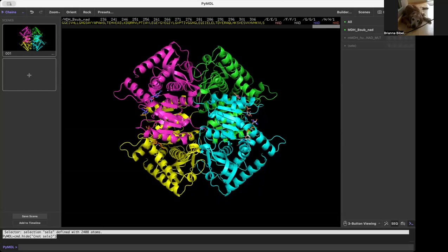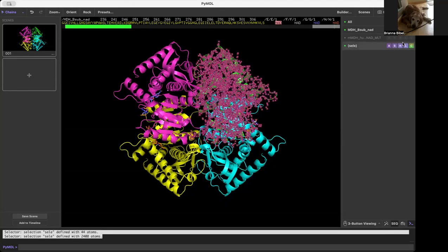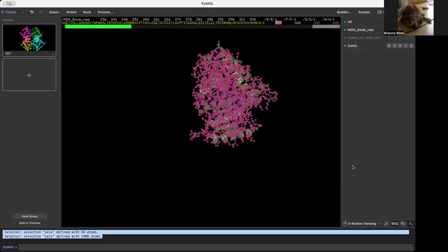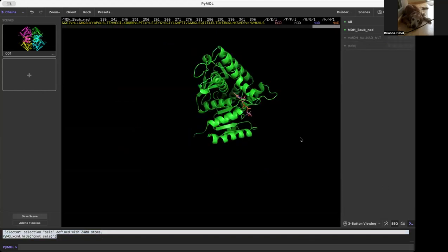A really helpful feature in PyMOL is Hide Unselected. Just select what you want, come over here, go to Hide Unselected, and voila! Everything else has disappeared.